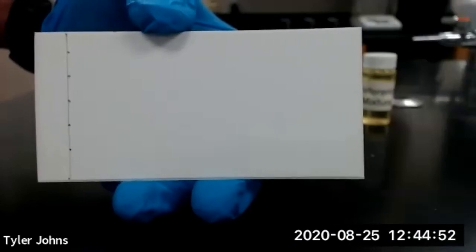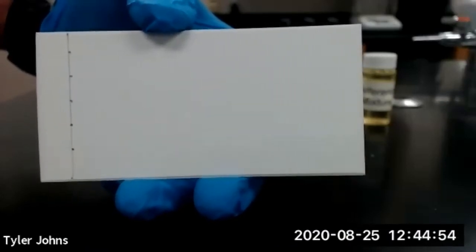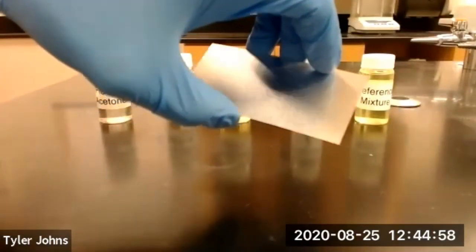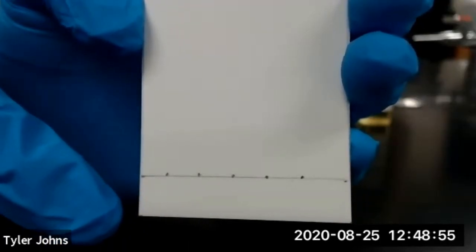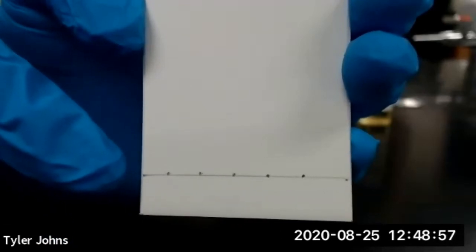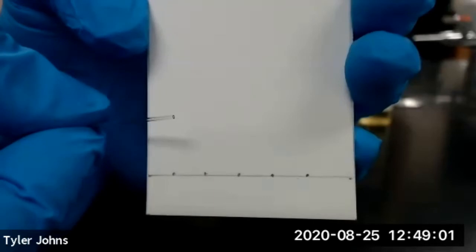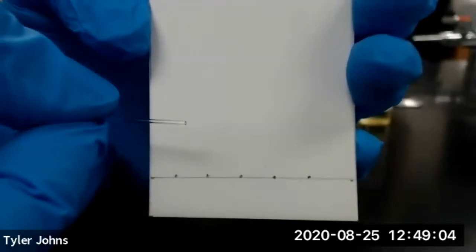This is our TLC plate, and it consists of silica gel on an aluminum backing. And we're going to spot each of our compound solutions one centimeter up from the bottom of the TLC plate using a micro cap or a very thin capillary tube.